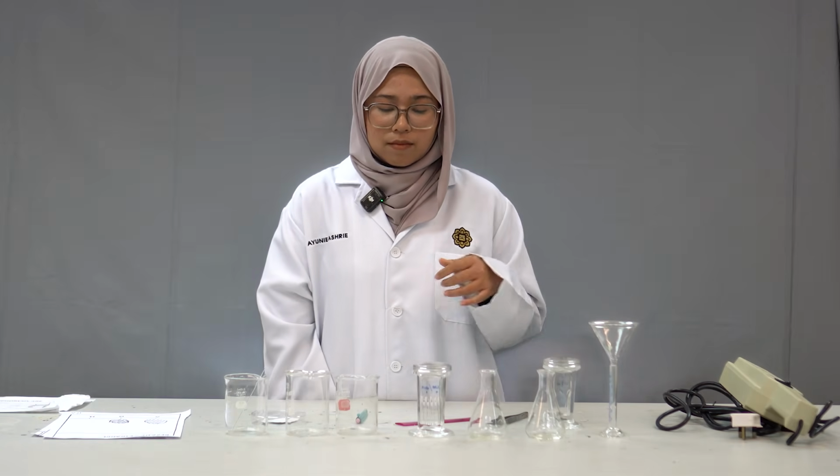And next, I will tell you about the 3 main examples of TLC use in real life. Okay, first, the pharmaceutical industry.